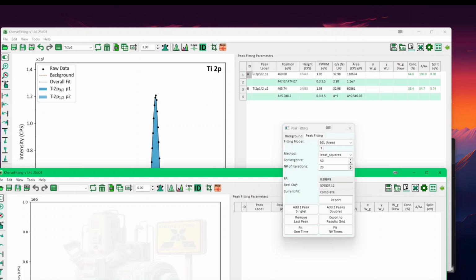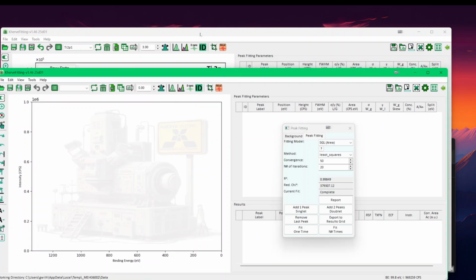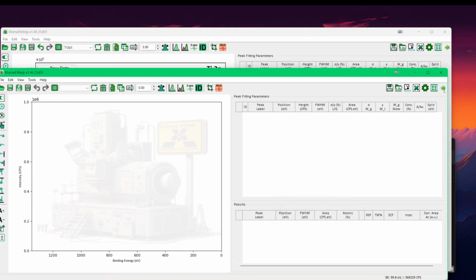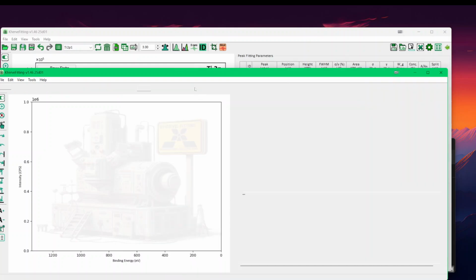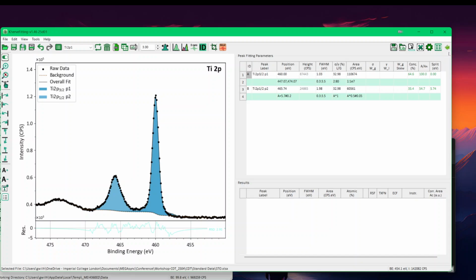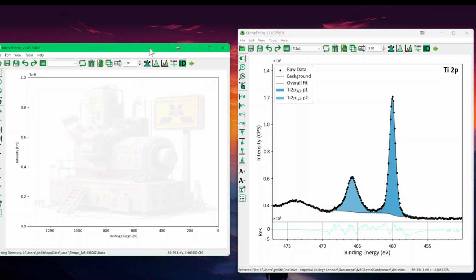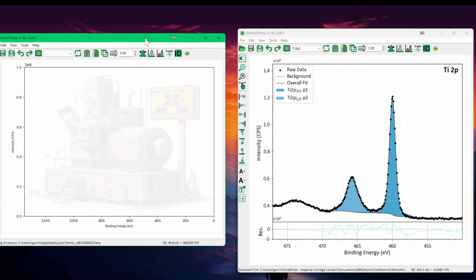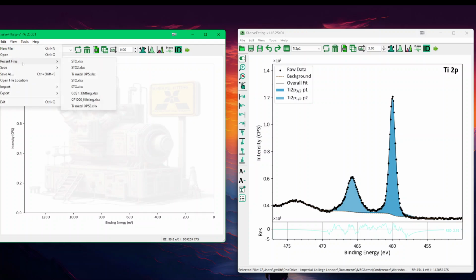Let me open it on my next screen. Now this is a bit cumbersome, where you can see that you get two KherveFitting windows at the same time. So I have added something here which allows you to minimize. You can toggle between right and left, and you can do the same here. Okay, so now you have two instances of KherveFitting.